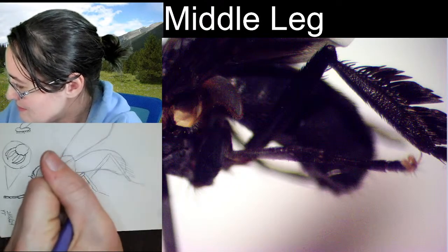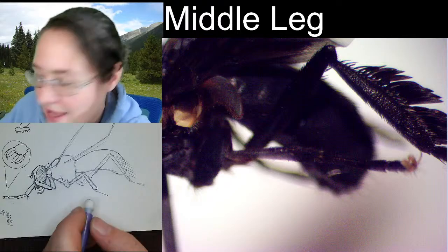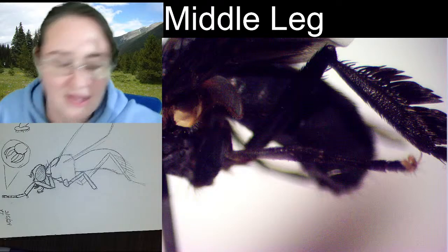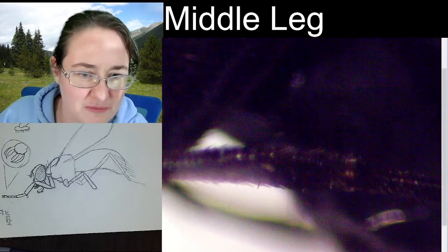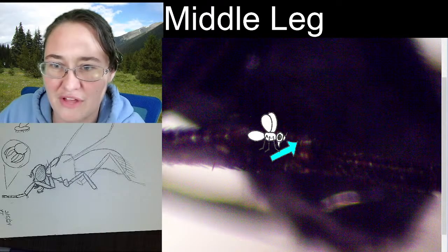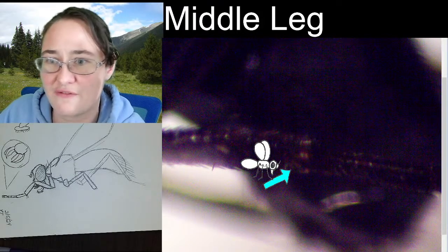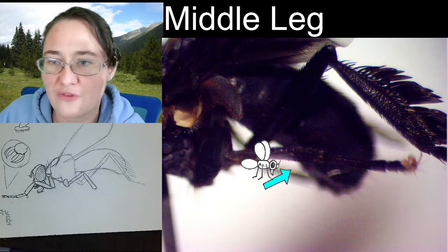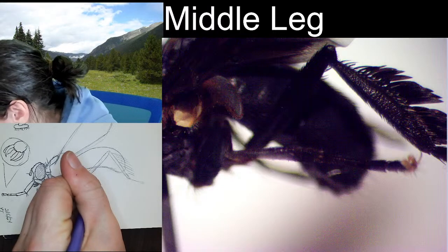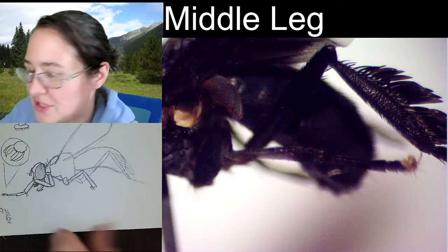Alright. Tibia, coming down. You still have tibial spines, and admittedly, I would like to say that there is almost a ring of tibial spines. It's been kind of hard for me to show because it's been a little bit dark, but you can see a little bit of the reflections. There's 1, 2, 3 here. There's kind of this series, and there's actually 4 of them right there. 4 tibial spines that kind of wrap around the bottom of the leg, so it would be on this side. Maybe only 3 visible from a lateral point of view, but there would definitely be 4 there.